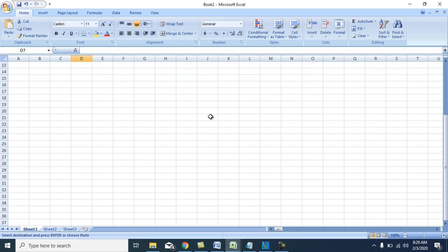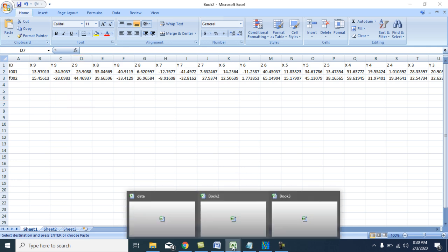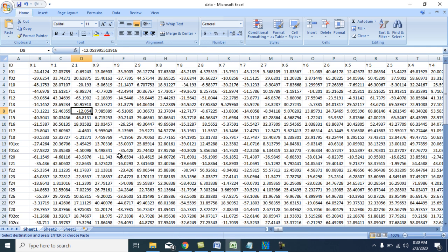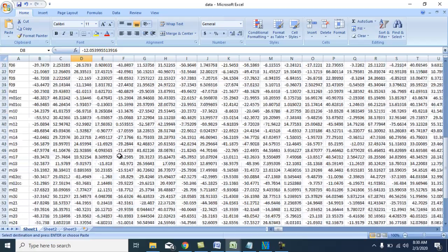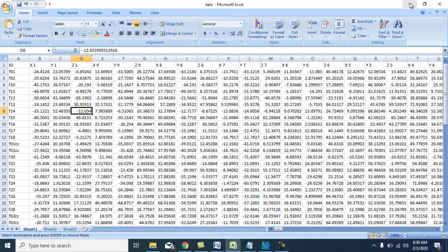So I'm going to show the sample for the next specimen. I've done it for all. So this is the data here now. I just show you the data here. I did it for all specimens. Alright. So I'm going to be using that to analyze later in our next part.